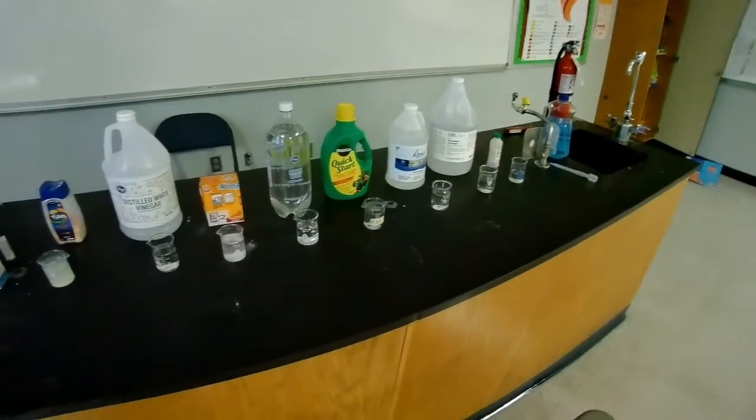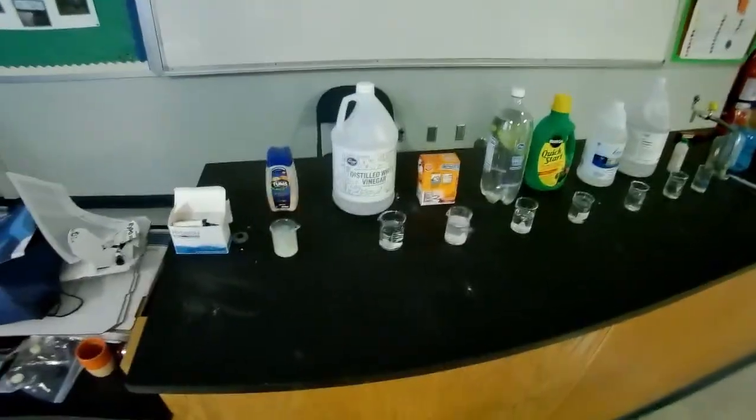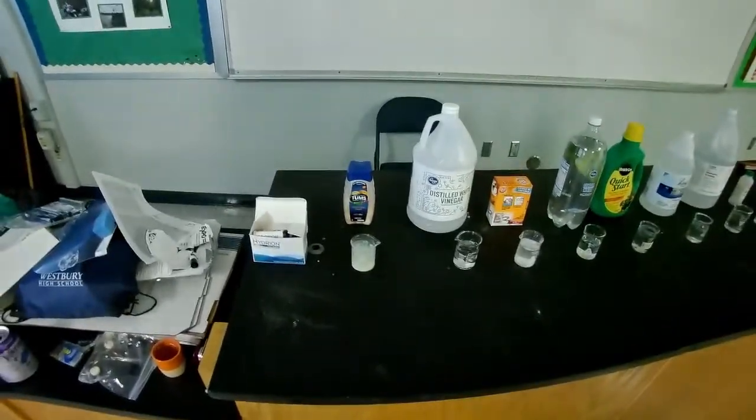All right, so let's go over our different chemicals that we're going to be testing today. Does it feel like you're doing a lab? It feels like I'm doing a lab. I don't know. Let's go over our first contender here.